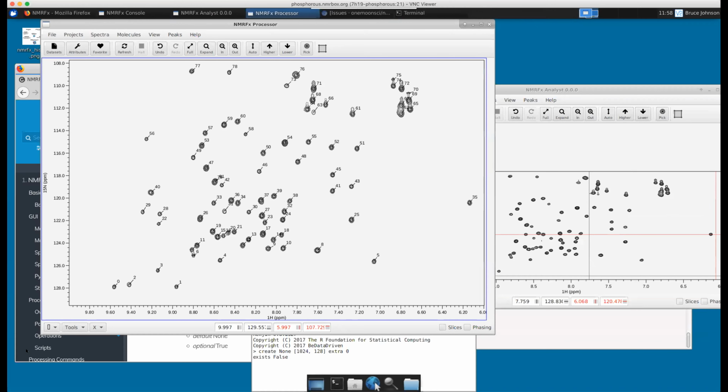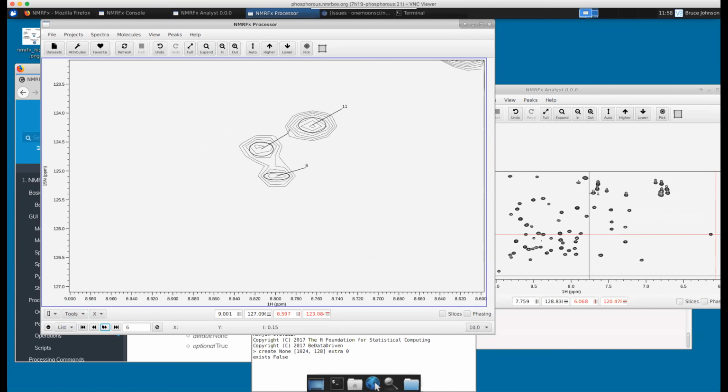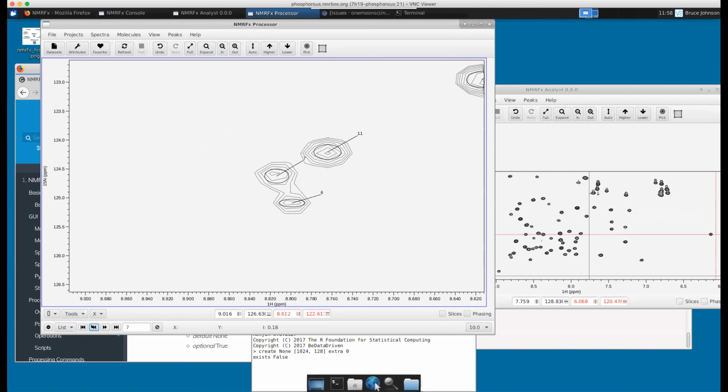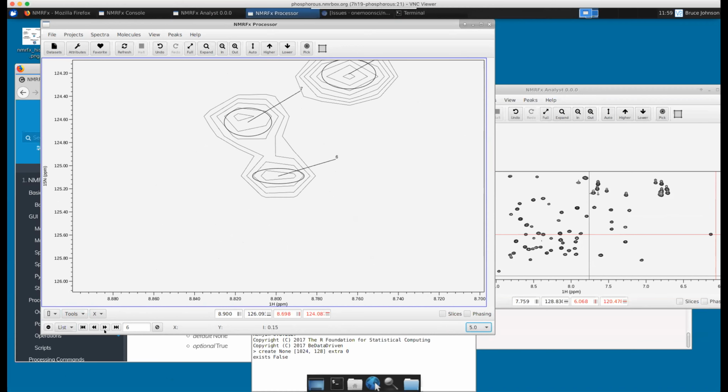Each spectrum has a toolbox down at the bottom. And so there's some peak tools here, for example, a peak navigator, and that lets us step through peak by peak. And so this is a good way to systematically look at every single peak in the spectrum. By default, this value 10 here says it actually measures the average width of all the peaks in the spectrum, and then it zooms to be the window 10 times, or I change this to a different number, 5 times, whatever you want, the width.